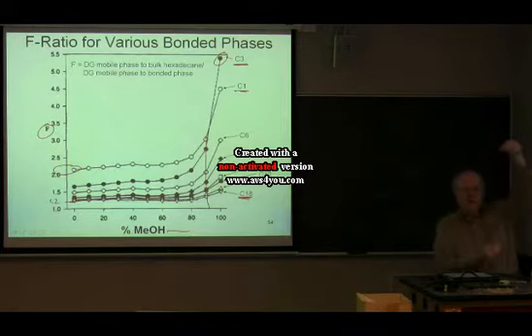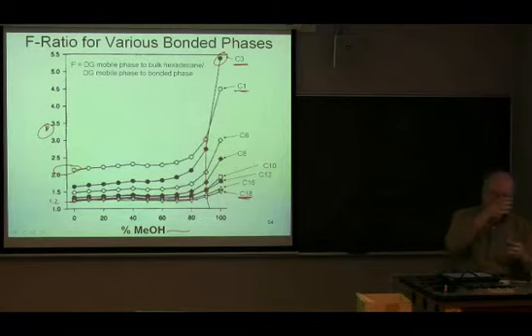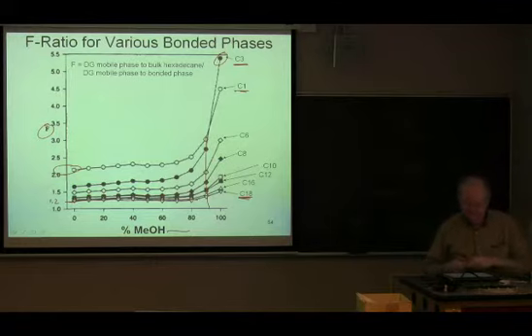With a long chain alkane bonded to the surface, the free energy ratio is pretty close. It's definitely not 1. It's a little higher than 1 relative to the bulk phase process. That is easily argued away by saying that when you glue something to a surface, you're going to change the number of configurations that that molecule can have, as opposed to when it's allowed to swim around at will in a bulk liquid.